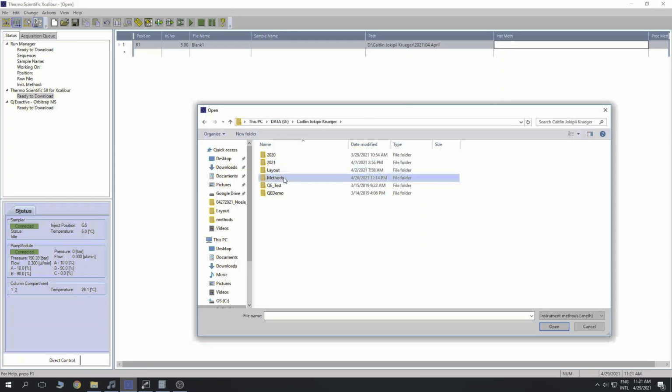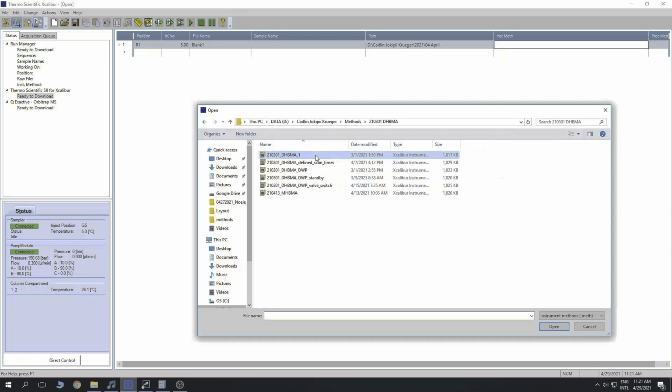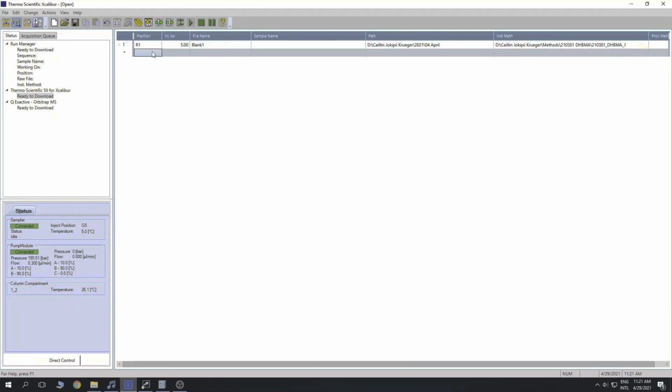And then you'll want to load an instrument method. So again, right-click and browse, and find the method you want to use for this analysis. So I'm just going to open up the method I've been using previously for an analyte called DHBMA. And now you're ready to add the next line of your sequence for your samples.